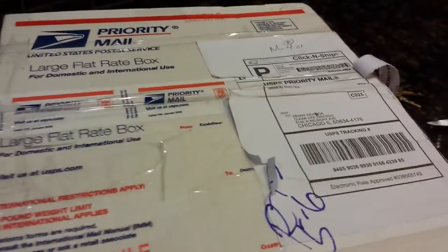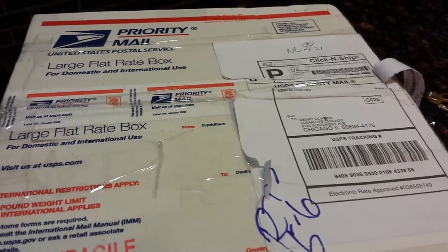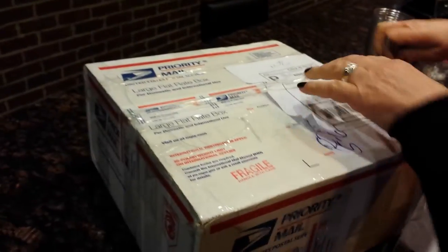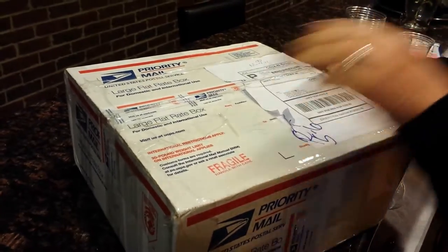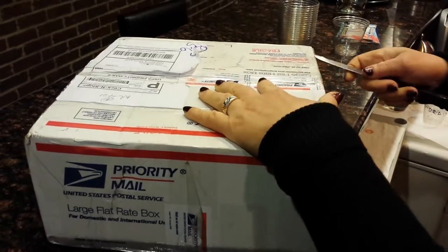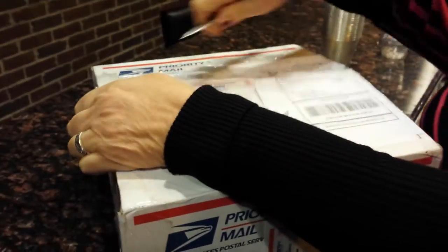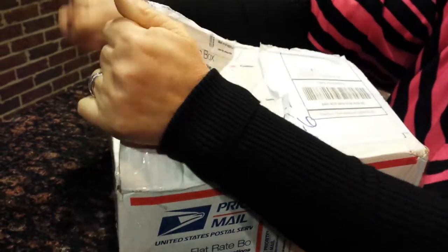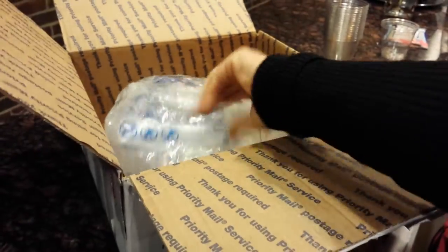My friend Steve from Mesa, Arizona sent us some water samples — we're going to do some water testing on this water. Go ahead Lydia, let's open the box to see what he sent us. We were talking about how contaminated our water is, and he wanted to see what was in his water.